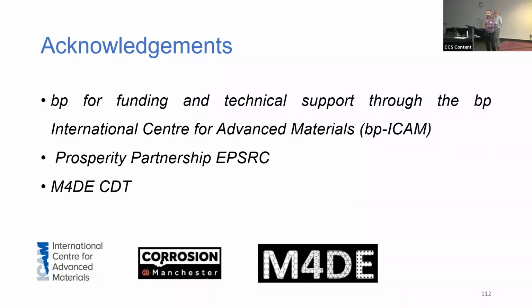Also, you mentioned the high-speed AFM. This would be better if we could do this at high speed, but one thing is that the tip probably wouldn't last as long if we were doing, say, video rate scanning. But I guess we could solve that by only imaging once every half an hour still. These images do take 20 minutes to take, so it would be better to have a high-speed image. I don't know the specific work that you're talking about, so I can't comment specifically on it. But yes, it probably would be better, but we don't have that capability here in Manchester, unfortunately.